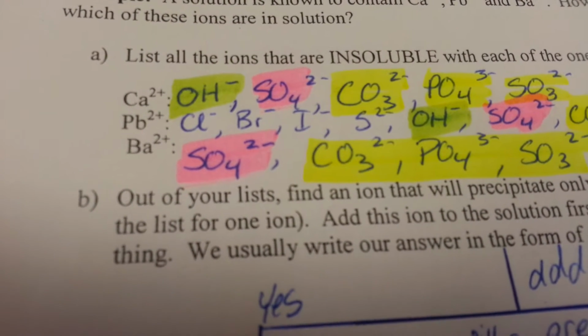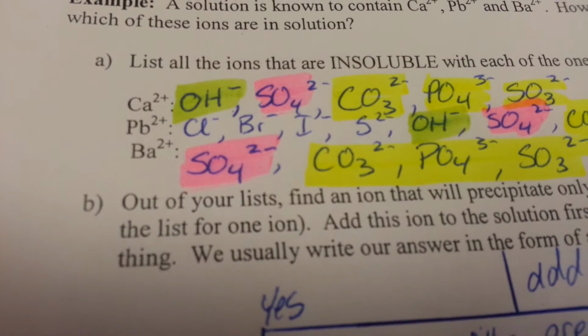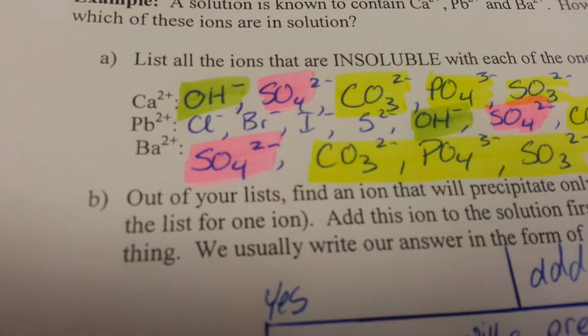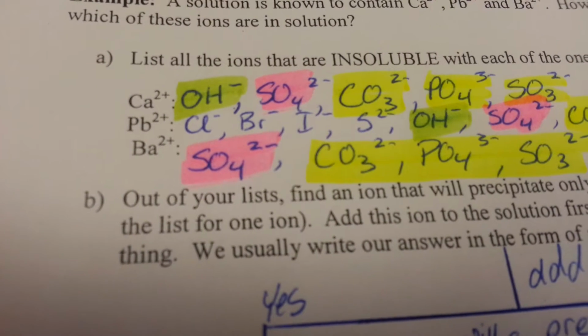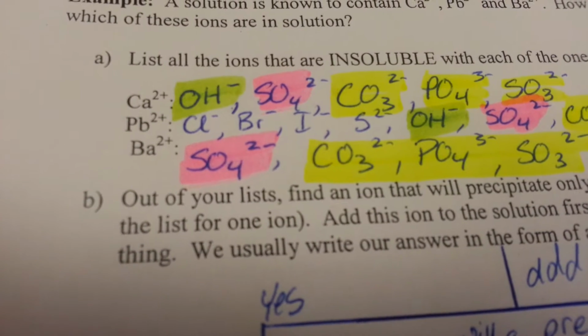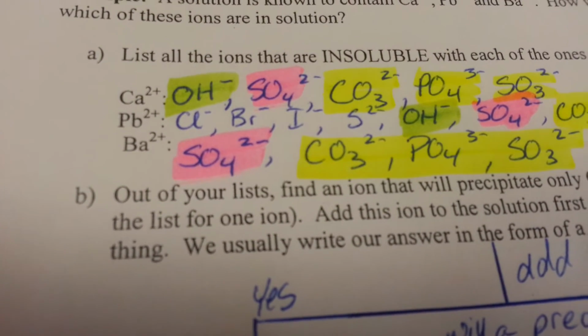Our next one should be calcium, because from a process of elimination, if we have eliminated all the lead ions, then we could use hydroxide ion to identify whether or not calcium is present in comparison to barium ions.